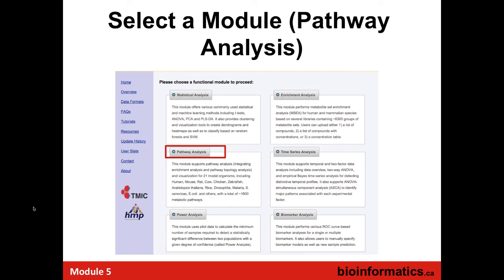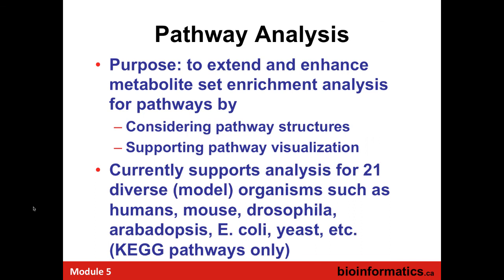It could have also, instead of just using pathways, looked at locational differences of metabolites or a few other things. But this is strictly for pathways, and it's perhaps a little more detailed. The pathway analysis is not restricted to humans. It works for 21 model organisms.